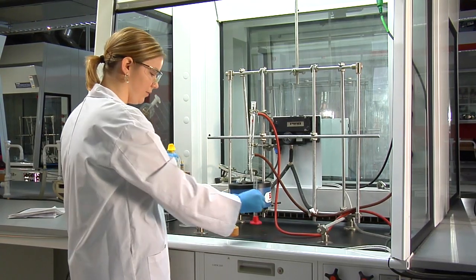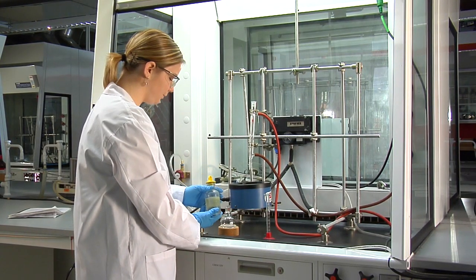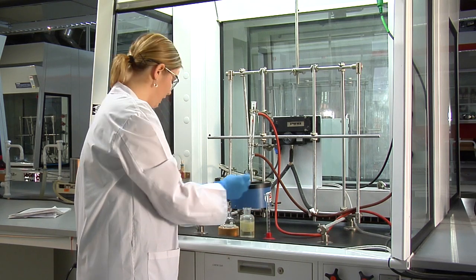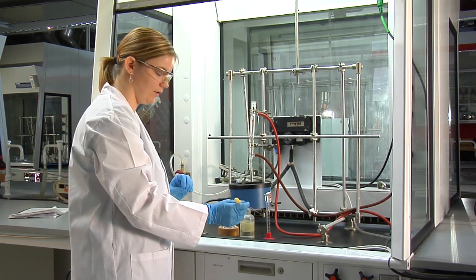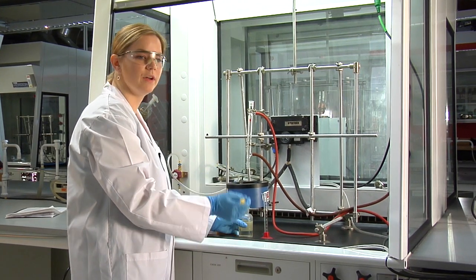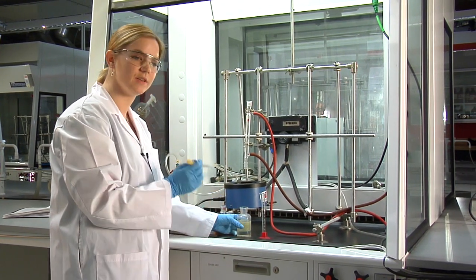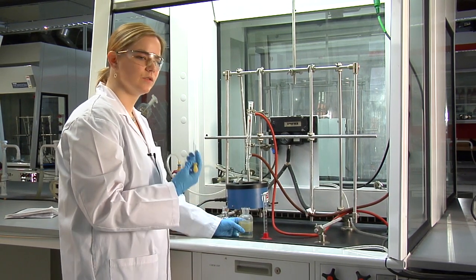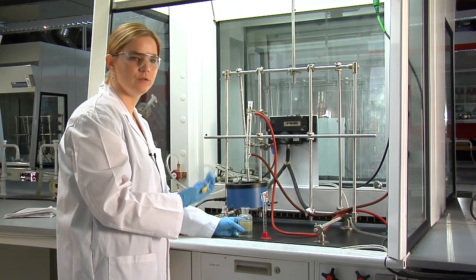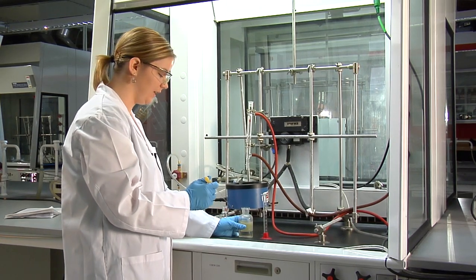Then we want to add 3 mils of the sulfuric acid. To do this, you want to make sure you're using a pipette to add it into the graduated cylinder. Never pour it into the graduated cylinder, it's very dangerous. The sulfuric acid is a corrosive liquid, so if you get it on your gloves, make sure you take your gloves off and replace them.